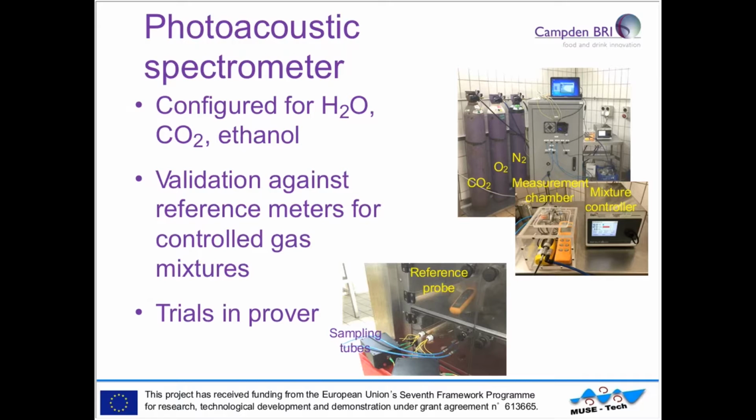And the third technology that we have in the MUSE-Tech multisensor is photoacoustic spectrometry. This is an optical technology for measuring concentrations of gases and volatiles. For the baking application, the device was configured to measure water, because we have humidity in a prover, carbon dioxide and ethanol. Both of those are gases that come from the fermentation process. We first of all did some validation using controlled mixtures of gas in the laboratory and making some comparisons against reference probes for each of those individual gases.